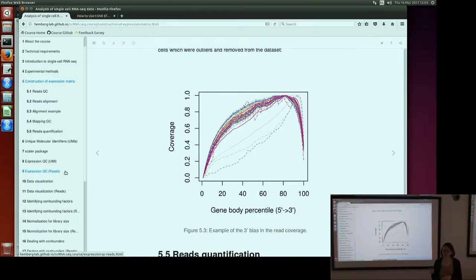So you'll probably just end up getting something almost the same as counts per million in that case. The main benefit of downsampling is that you have the appropriate number of zeros in each cell, which you wouldn't have when you're averaging, because the zeros will be in different places in different downsamples.